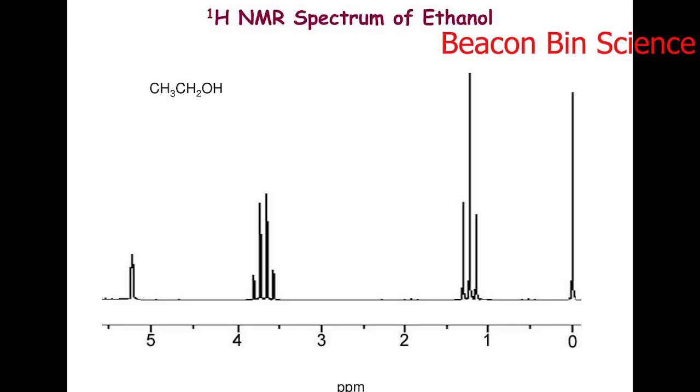Integration equals 3 hydrogens for the first signal. Integration equals 2 hydrogens for the second. Integration equals 1 hydrogen for the third. Pretty cool, right? But hold up.